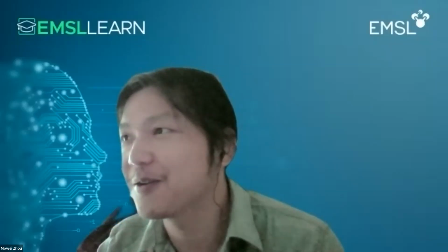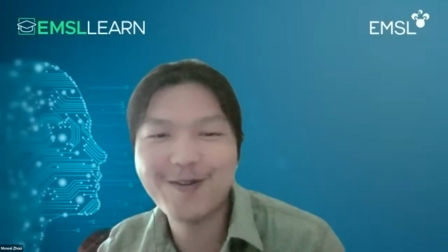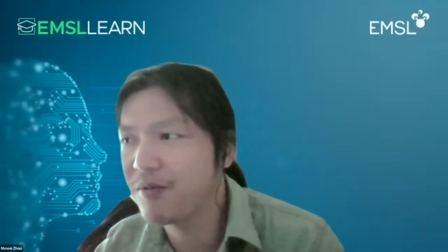Great. And a question from Jenny Broadbelt. How much optimization did you need to do for the matrix used for the MALDI of intact proteins? It does require a lot of optimization. And the washes are important to desalt the samples and also not wash off too many things. Even if you do imaging with different modalities like nanoDESI or MALDI, they tend to give different coverages. I think the extraction step is very important, and there are many variables we don't fully understand yet on what protein gets preferentially extracted by which. I think there's a large space to explore.